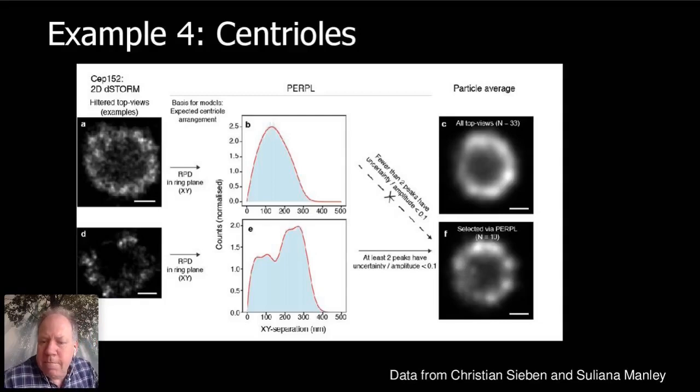We have done a little bit with STED data in terms of a slightly different application, which is looking at co-localization. You can get XYZ data out of that by doing some processing and then comparing your XYZ. So this is what we did for the co-localization approach. You can always get XYZ data out of your images because you know where your pixels are. So it's just another processing step in there.